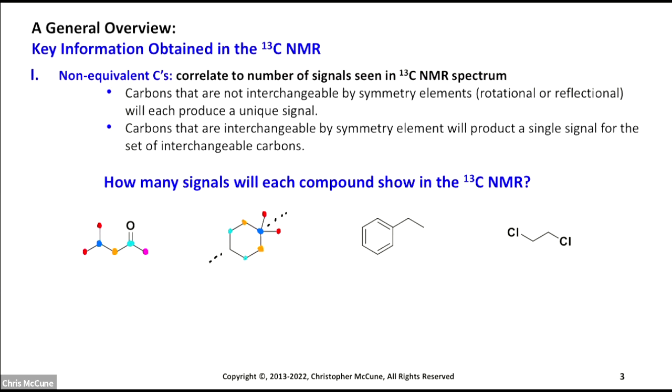And then lastly, we've come to the other end of the molecule. That CH2 is different from all the other CH2 because it's just next to different carbons. And so those are all nonequivalent in terms of the different colors.